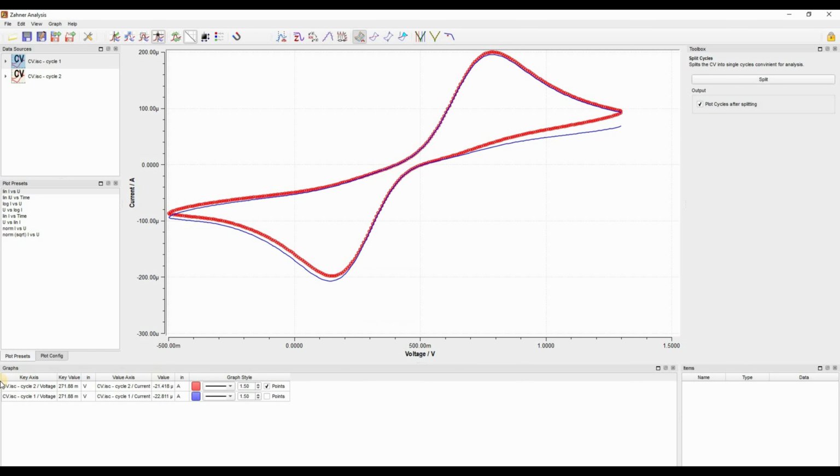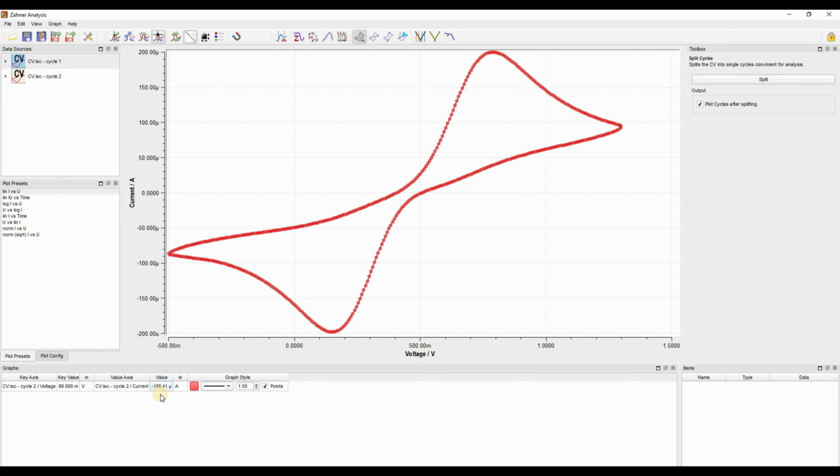The area which I just used is this area, which shows me my graphs. Here you can change the color of your graphs which are in the graph area. You can give them points in spite of lines or lines with points. You can change the size of your line. You can make it thicker or thinner. You can also click on a graph and then click delete on your keyboard, and then the graph is gone.